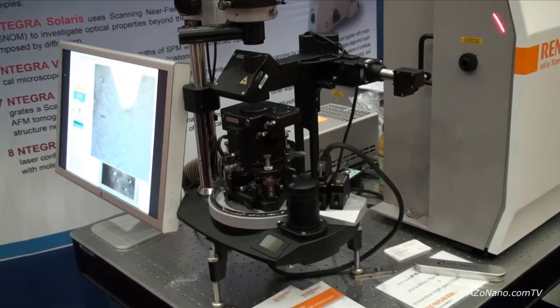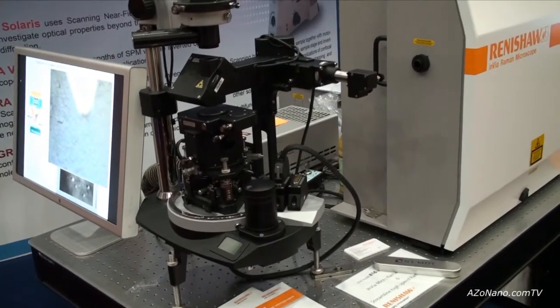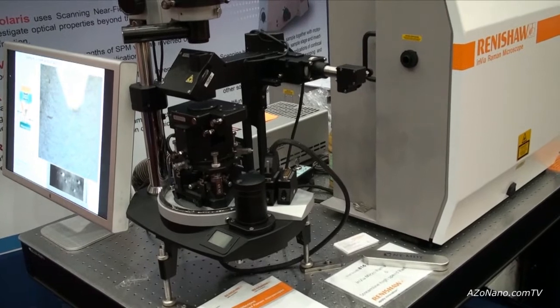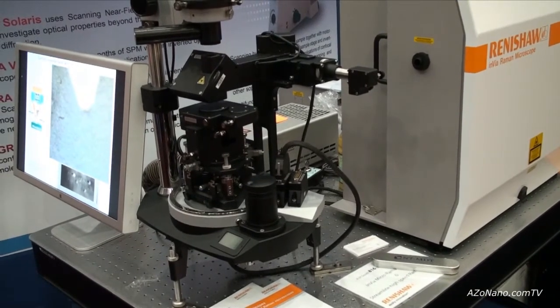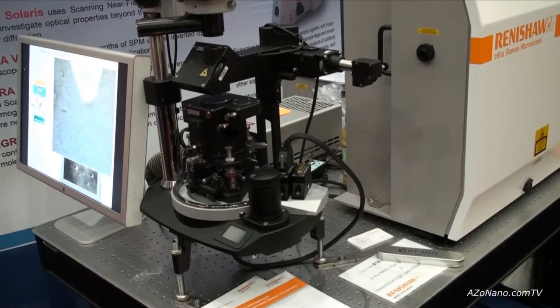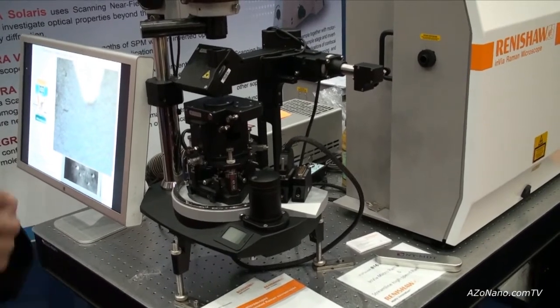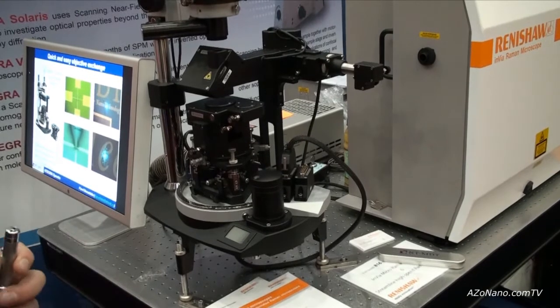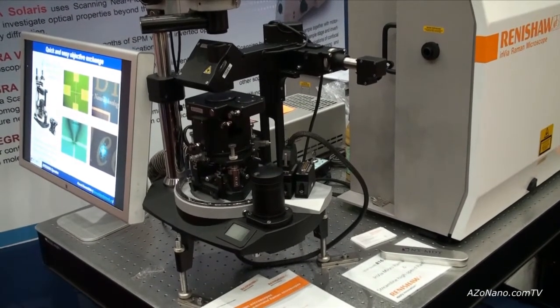You see, this flexible design allows to switch your application from one to another very easy way without investing extra money to get another AFM. And that was one of the key features of the Integra platform, which nowadays includes six different models.